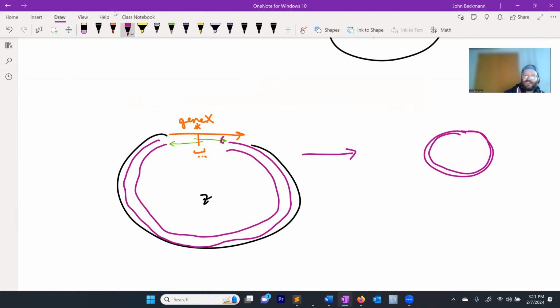So there's now a plasmid that was synthesized by PCR. And because that synthesized product incorporated those primers, it now has a mutation at the position you chose, okay? In contrast to the template, which still remains the same. That's the gist of what you do, okay?